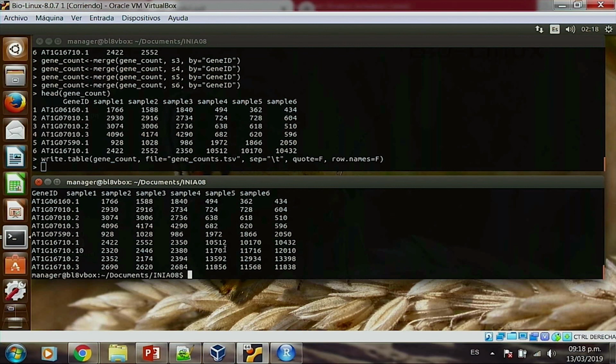Yeah, you need to re-generate that. You need to rerun the gene count from the sum, and reload all the data. You should have S4 complete now. So we've written this. We have the gene count table. That is excellent.